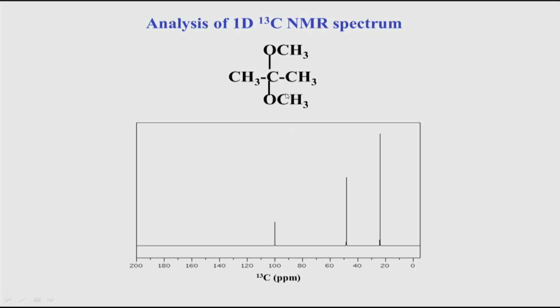So, therefore, the CH3 also comes somewhere between 0 to 20, but that will not hold if there is an oxygen attached. Again, if you look at that chart which we had seen earlier, it was somewhere between 50 to 100 ppm given for the OCH2 or OCH3, and this is basically coming from there.